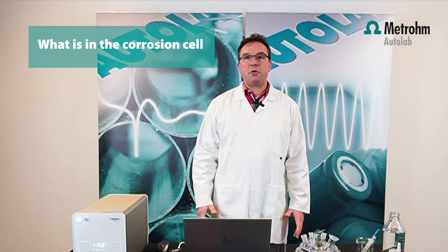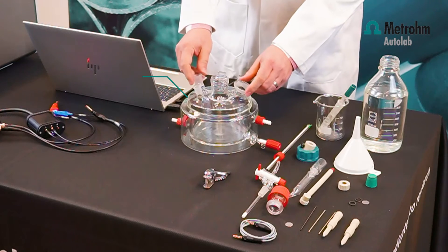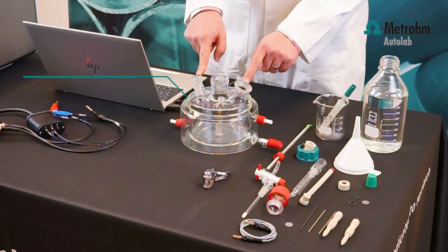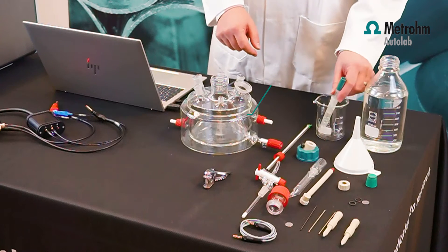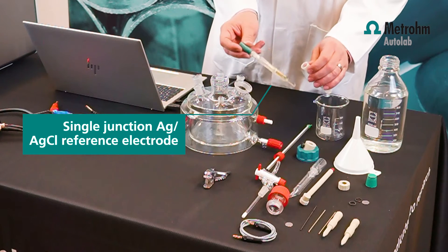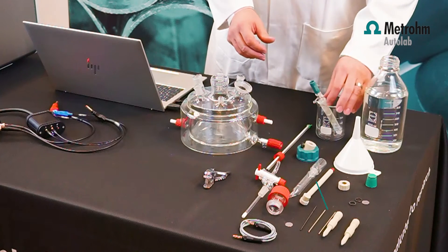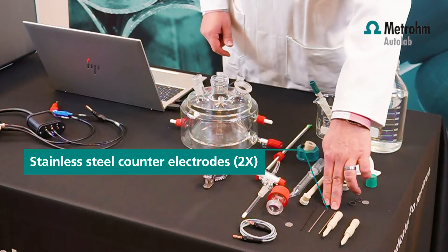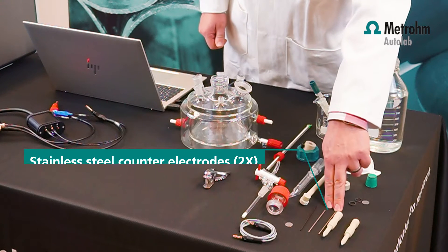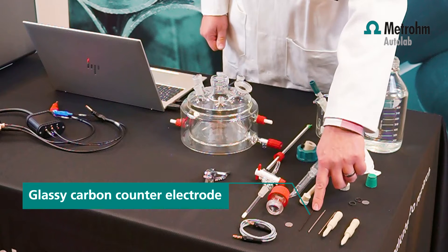First I'm going to show you what's inside the corrosion cell box. We have the one liter corrosion cell, a single junction reference electrode, and two stainless steel counter electrodes. The stainless steel counter electrodes can also be exchanged with glassy carbon.